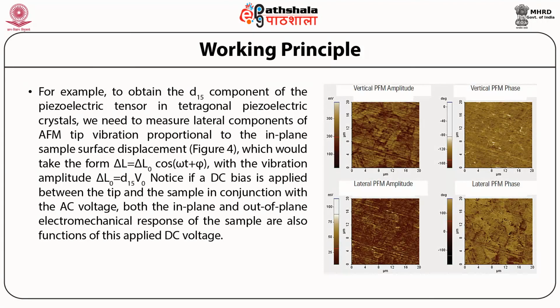Let us say, for example, to obtain the d15 component of the piezoelectric tensor in tetragonal piezoelectric crystals, we need to measure the lateral components of AFM tip vibration, proportional to the in-plane sample surface displacement as shown in this figure, which would take the form delta L equals delta L_0 cos(omega t plus phi), with the vibration amplitude delta L_0 equal to d15 V_0.